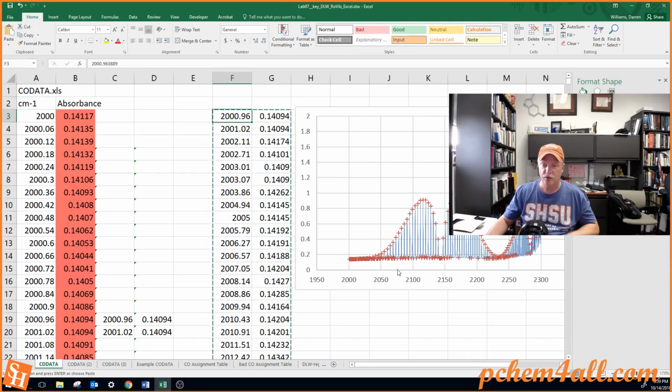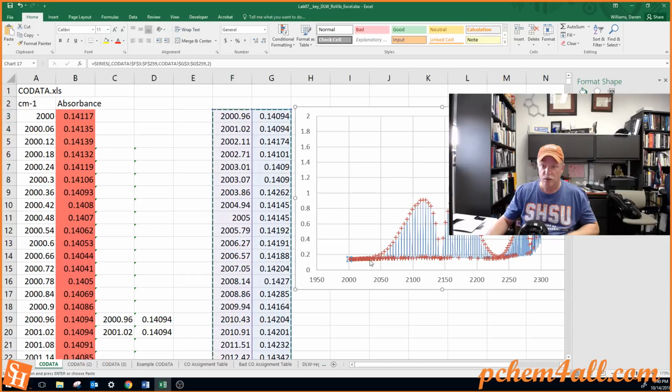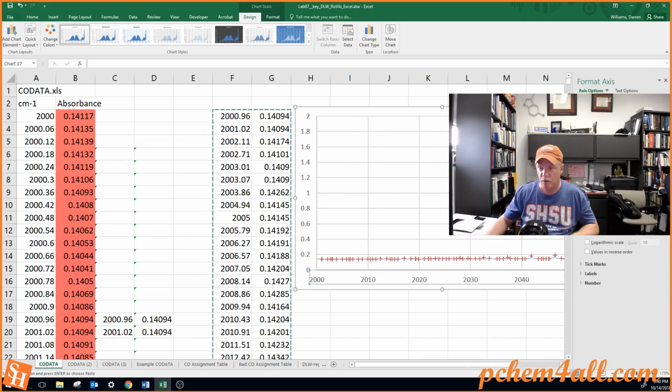And so we might have to zoom in here to see which ones we want, but let's go ahead and zoom in from 2000 to 2050. So come up here, 2000 to 2050. And we see our first peaks that we want to keep are really not showing up until 2046, 2041.